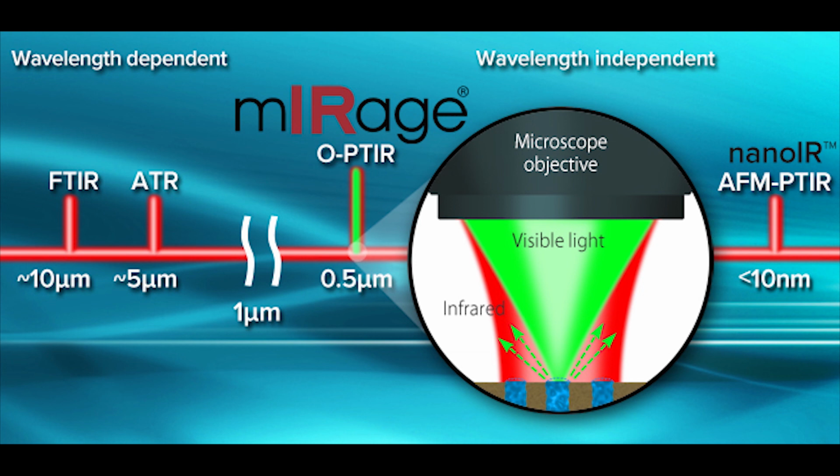What's a bit different about what we do is that we are focusing our probe light beam directly onto the sample, and we are not so sensitive to the changes in the index of refraction of the air, which is quite small. Instead we're measuring the photothermal response of the sample itself, so its thermal expansion and the change in index of the sample itself. This is part of the reason why we get very high spatial resolution. If we were measuring an effect from the air, the heat would go up into the air and diffuse, and we wouldn't get high spatial resolution. Instead, we're measuring it right at the point of absorption.